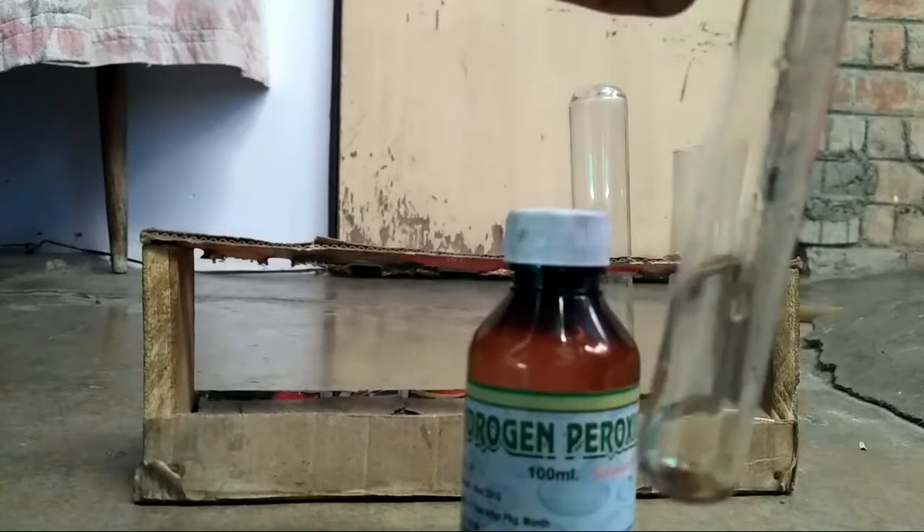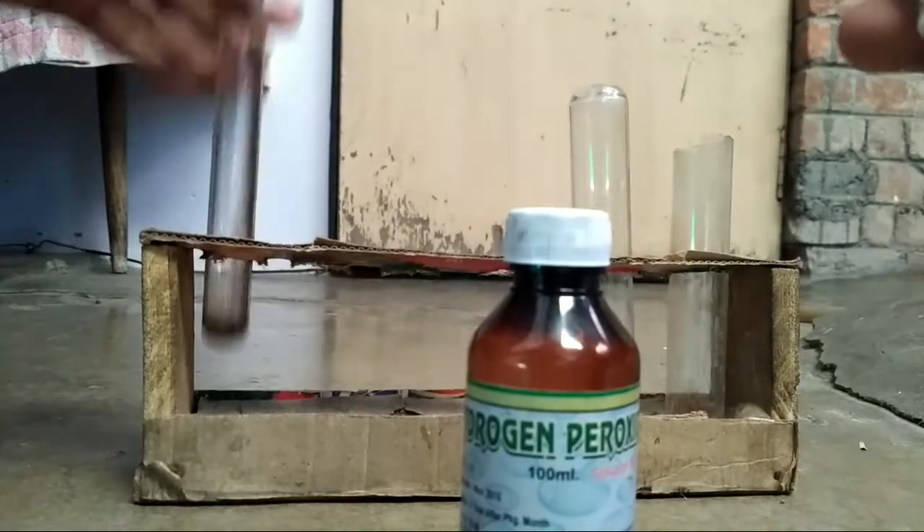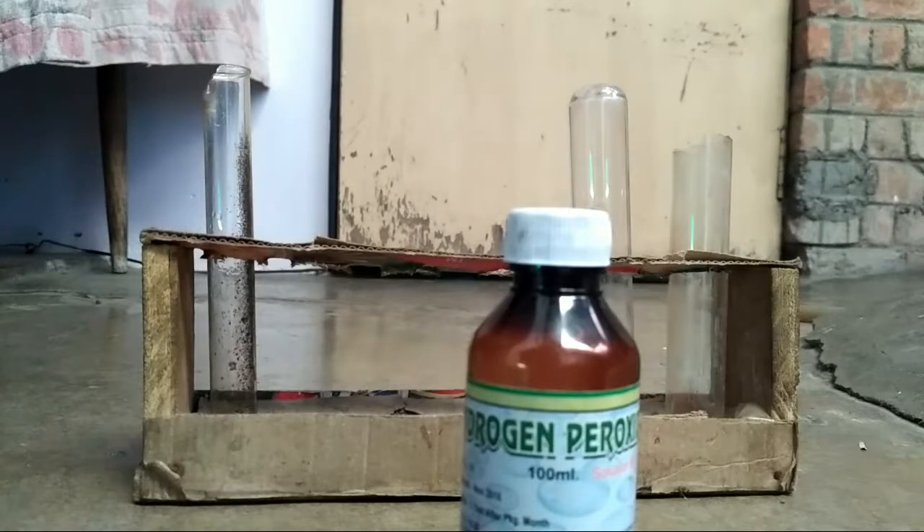I will take some manganese dioxide in this test tube and pour a little hydrogen peroxide.